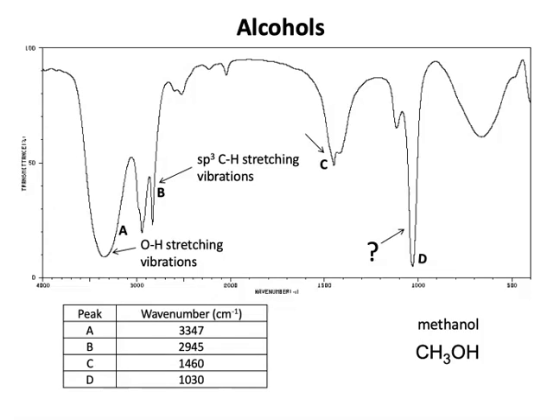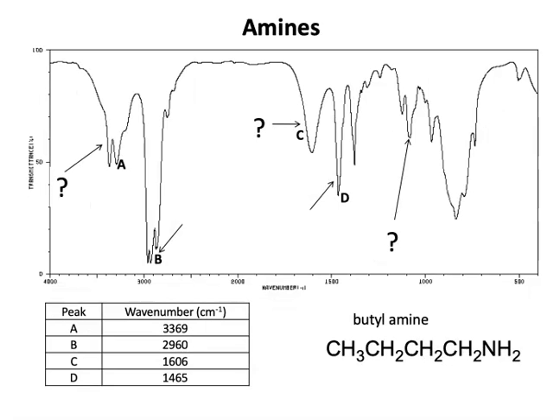One other group that we'll take a look at here is an amine group, and notice how different it is from an alcohol. So here's a typical amine, and the area that we're going to look at to identify an amine relative to, let's say, an alcohol or something else is what I think of as double cow udders.